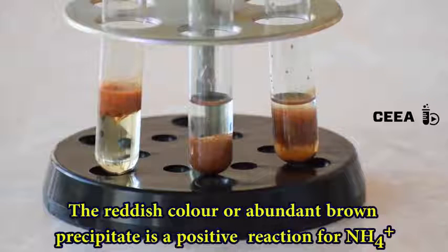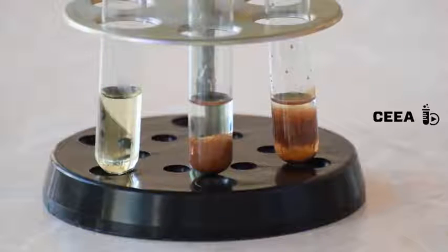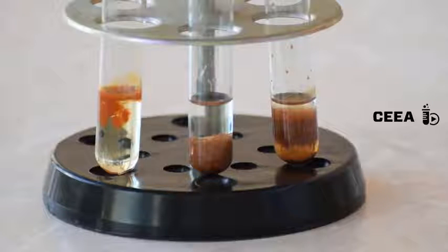This reaction is a very sensitive one. At very low dilutions, we don't get a precipitate but a reddish color. Measuring the intensity of the color with a photometer, we can set up an analytical procedure for measuring the content of the ammonium ions in water.